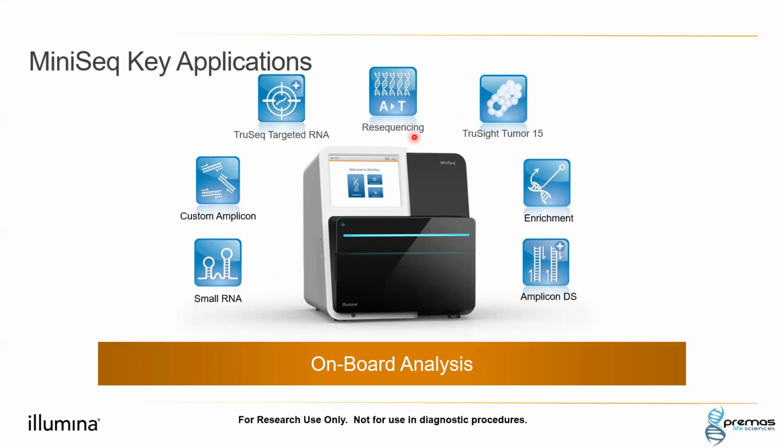Resequencing is an application wherein you have the reference already there and you want to refer to it. So this can be done.